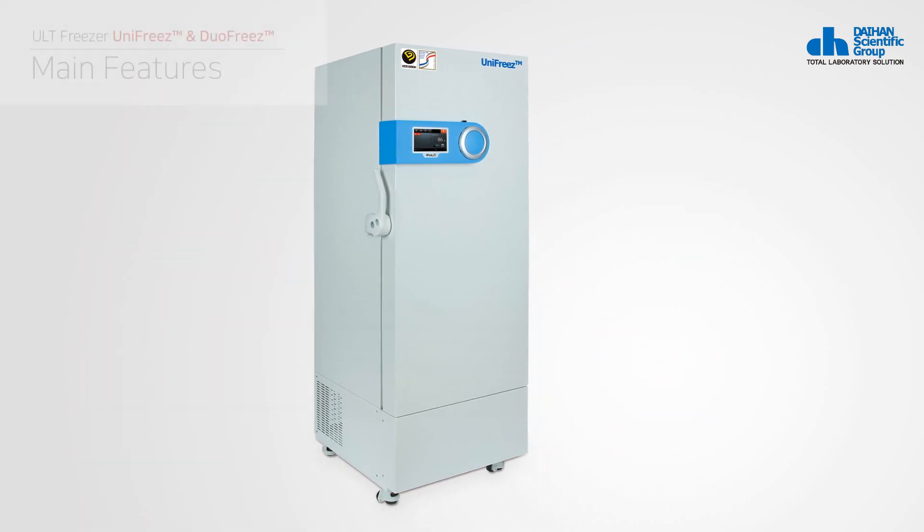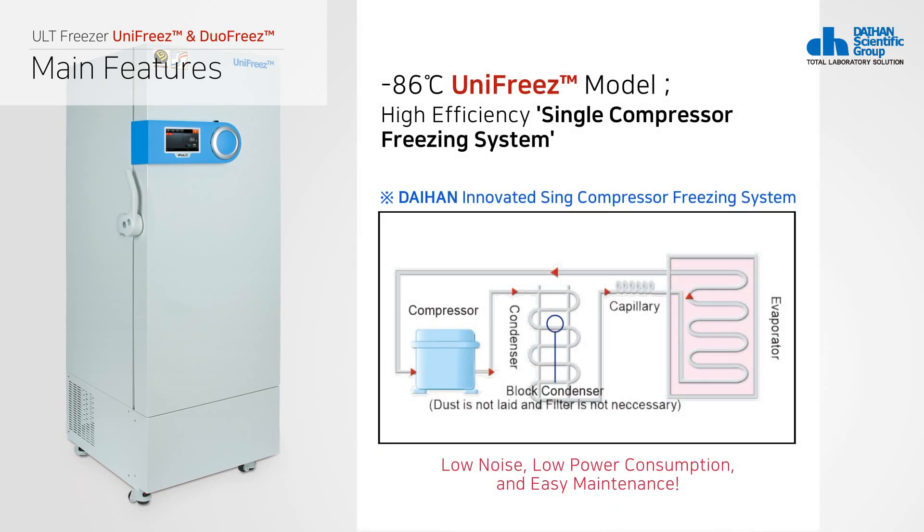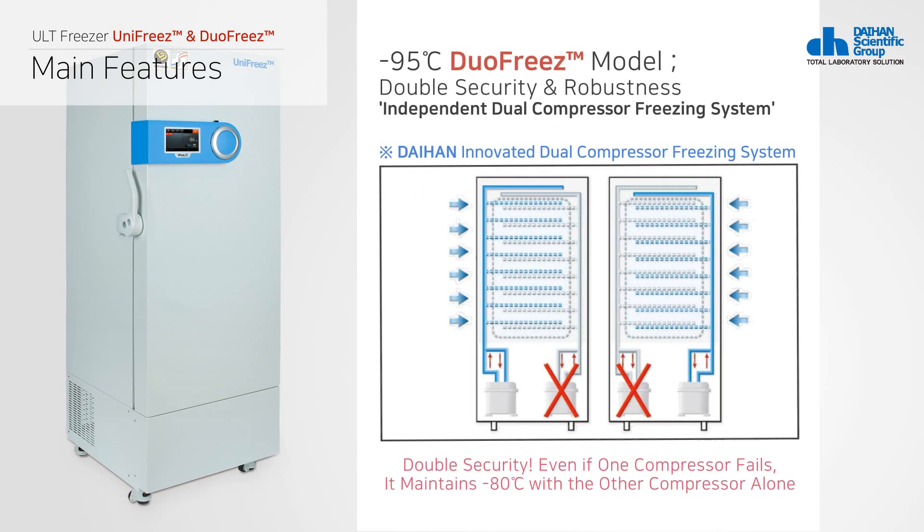Daehan Scientific's Unifreeze ensures fast cooling speed and minimal power consumption by applying the new Unifreeze system and groundbreaking cooling system. Duo Freeze's two independent Unifreeze systems ensure that the cooling temperature is maintained even if a problem occurs in one system.